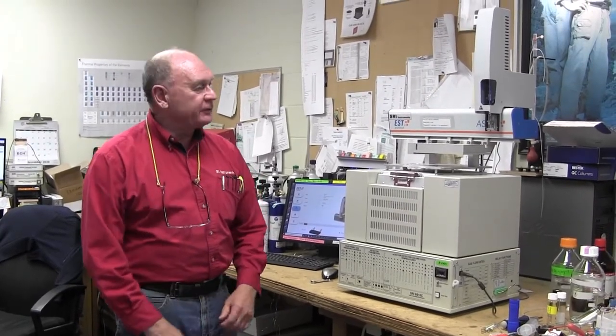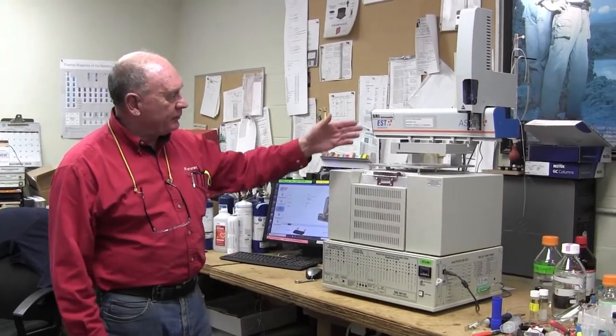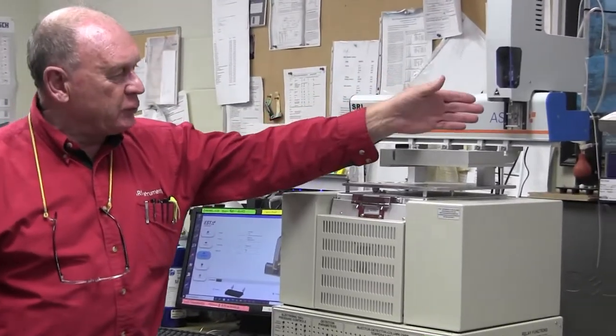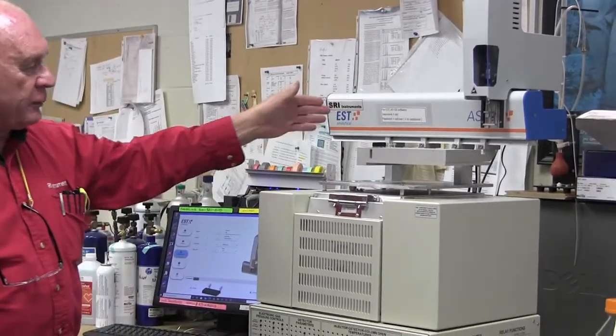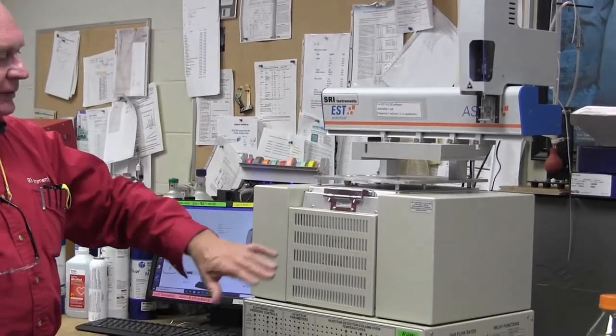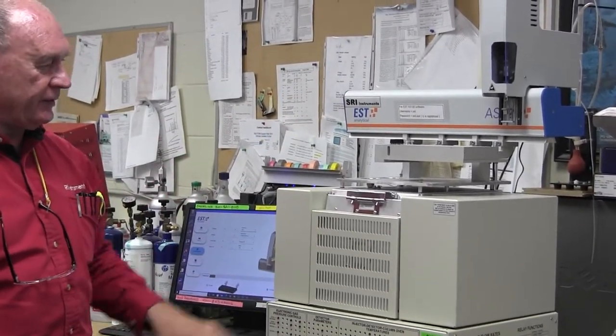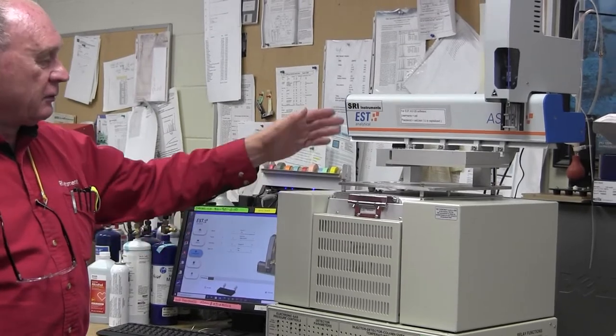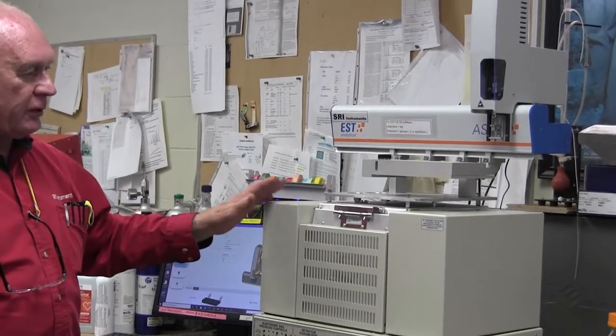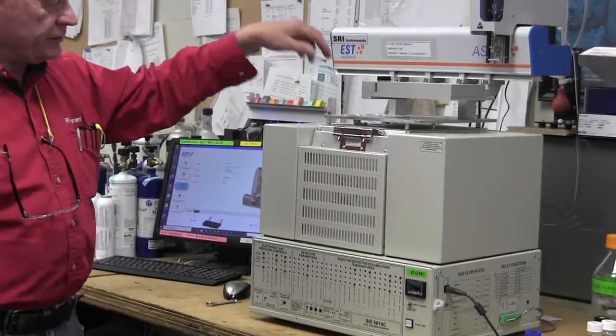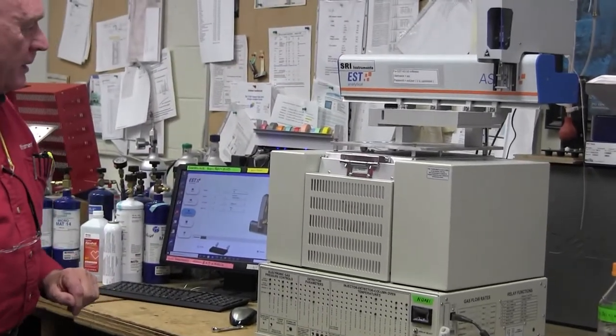I'm Hugh from SRI and this video is going to show you how to put the AS120 liquid auto sampler on top of the 8610CV, which is our vertically oriented GC. The injection is vertical.